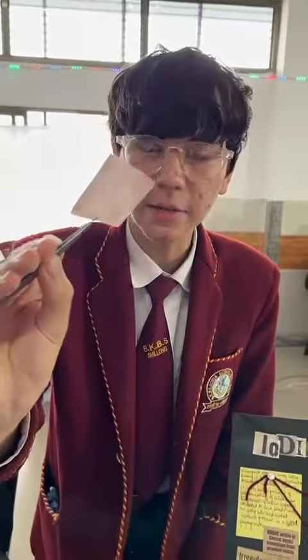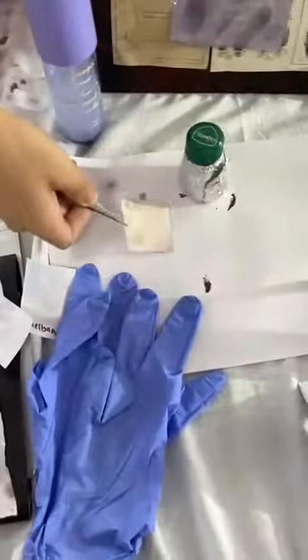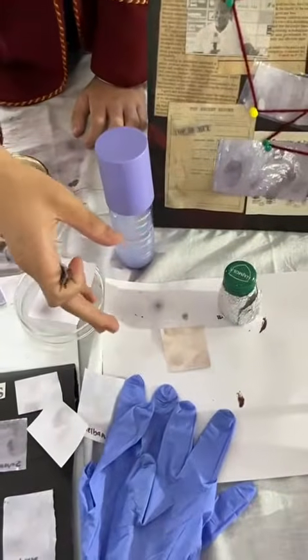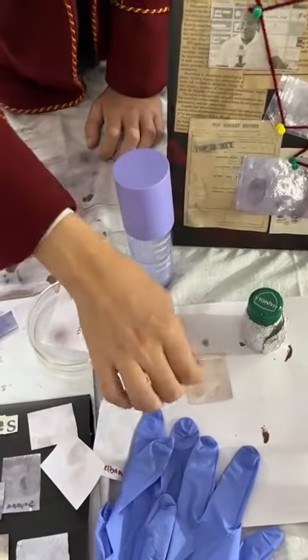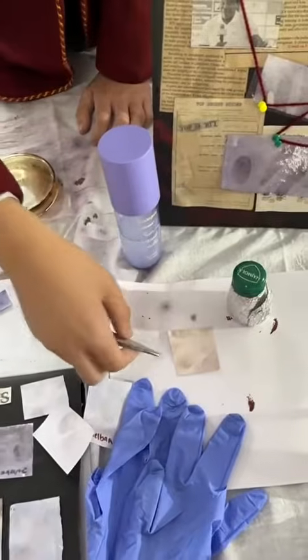Now the problem is, your document now is very dirty. Look, it's very dirty. Now its advantage comes in. The advantage is that if I just leave this like this, no chemical needed, nothing, all this stain will go away. Why? Because iodine will sublime again. It will change from a solid to a gas, and it will leave the paper. And this is the main advantage, and it does not damage the evidence found at the crime scene.